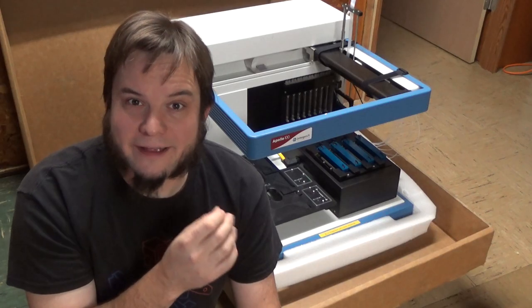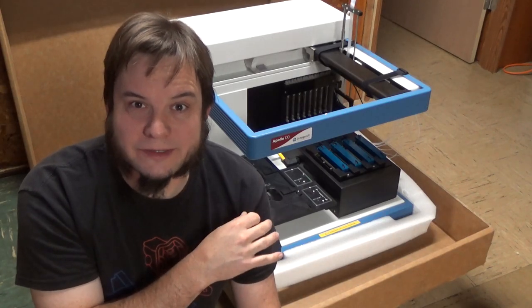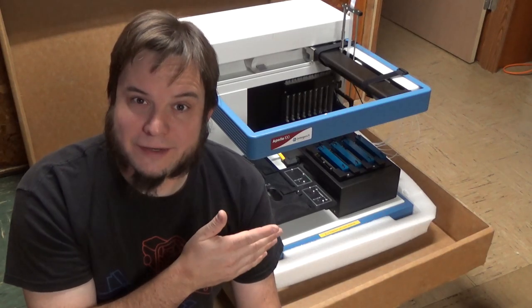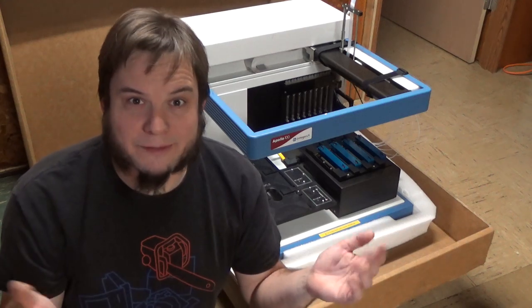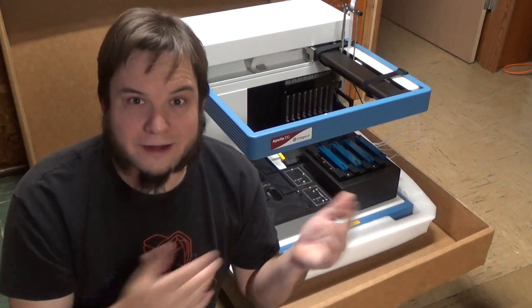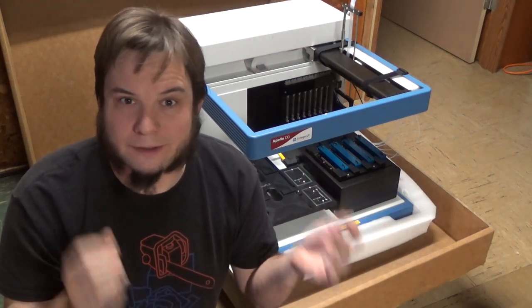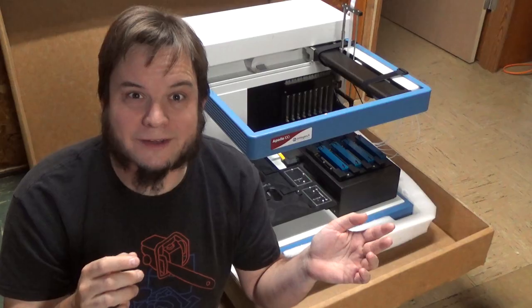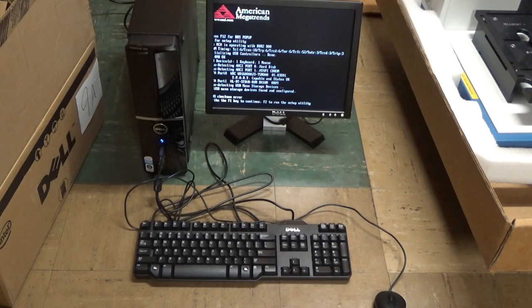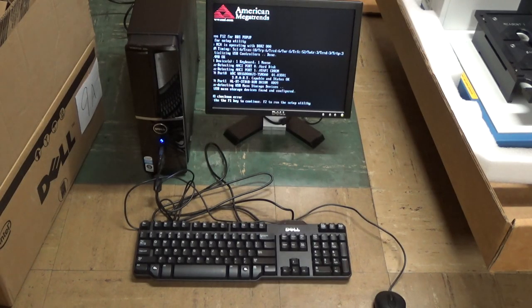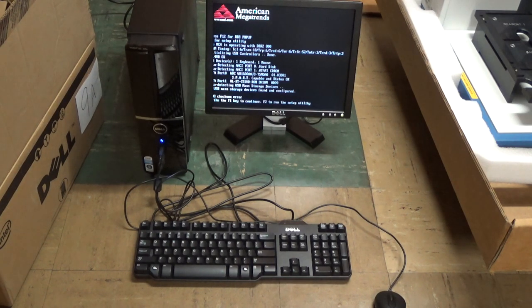Since I have absolutely no idea how to properly use this, the obvious next step is to hook up the computer, turn it on, and see if there's a button in the software for start cloning dinosaurs. Hey, the computer seems to work at least, so if nothing else, I've spent my $85 wisely on a computer from 12 years ago that's worth $20.